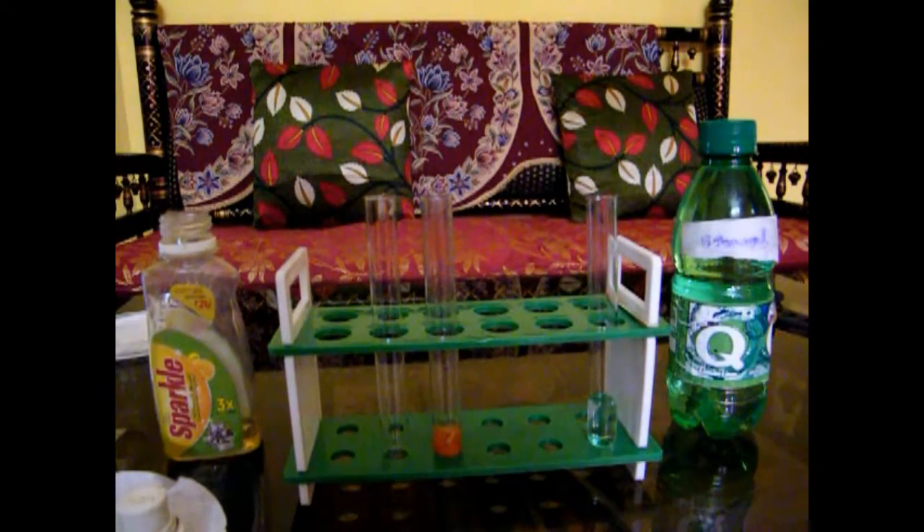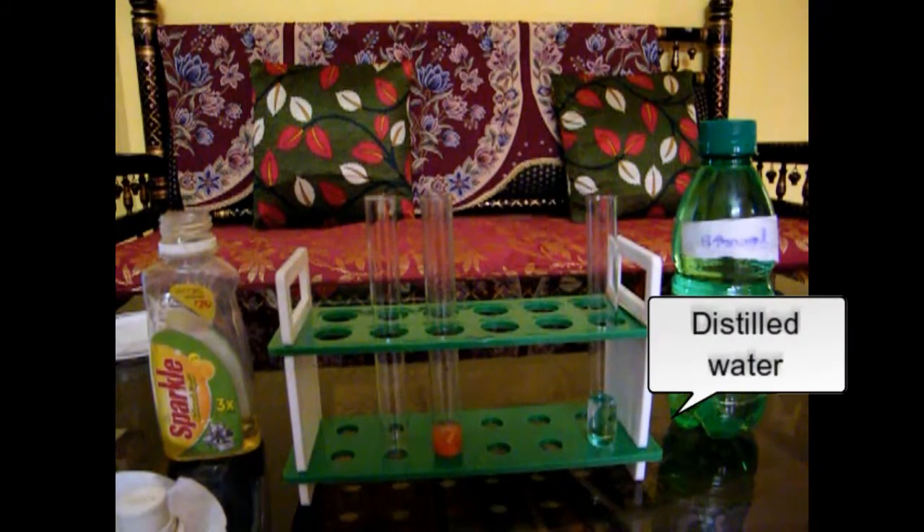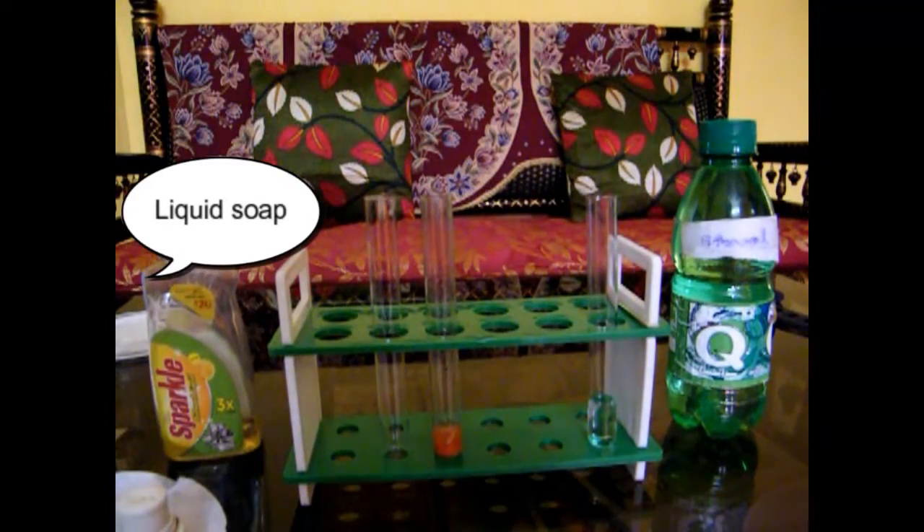Hello everyone. Today we are going to extract DNA from plant sources. DNA can be extracted from blood as well, but now we are focusing on extracting DNA from plant sources. This can be done using any vegetable source — I am using a tomato here, but you can use peas or onion, etc.